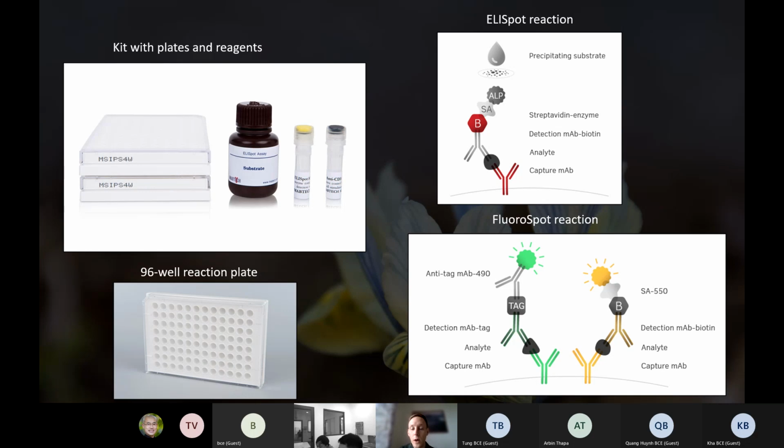And that will enable you to also start analyzing different subpopulations. So you can imagine that in the well, you could have a cell sitting at one location and it's producing both this analyte here, which could be, for instance, interferon gamma, and then another analyte here, which could be granzyme B. And then the location overlaps between the yellow and the green color, and you get the color combination or an overlay.